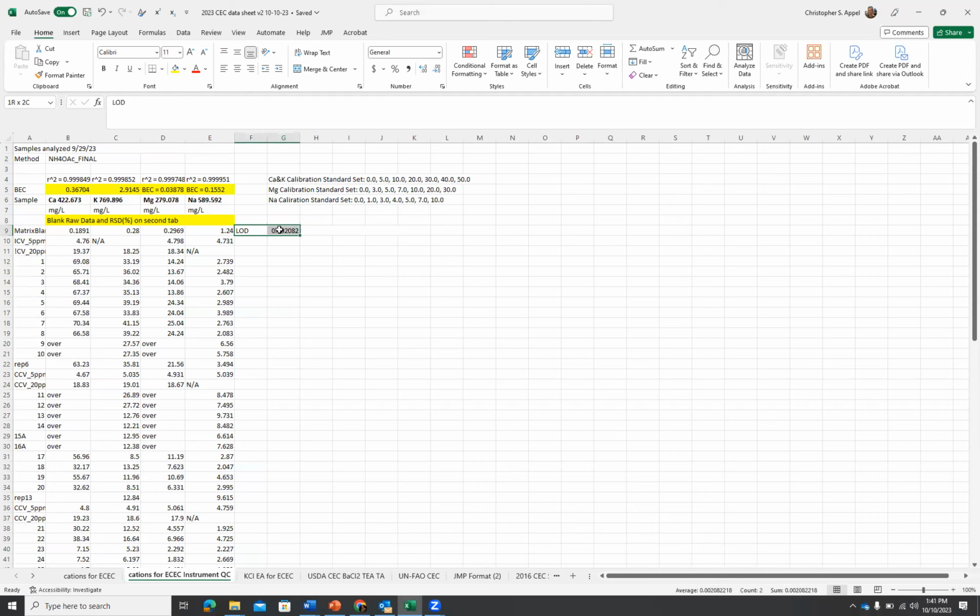Move it up here then. Okay. Did you get the same values that I did? So RSD are these values right here. It's right there.